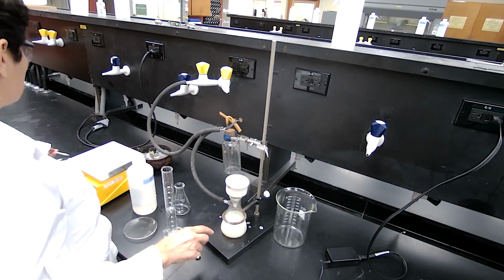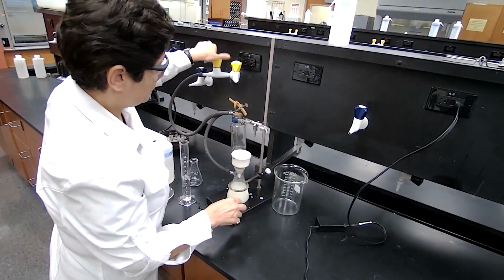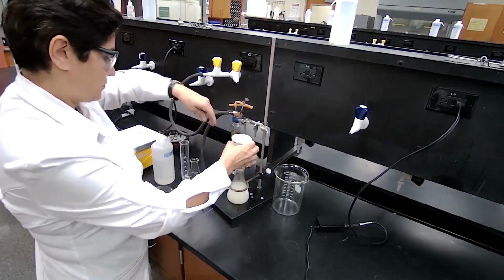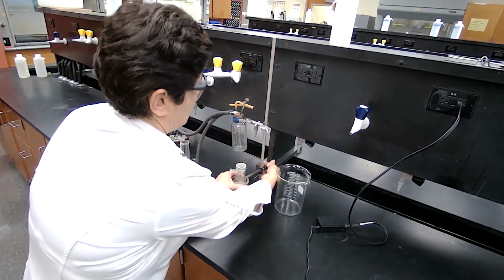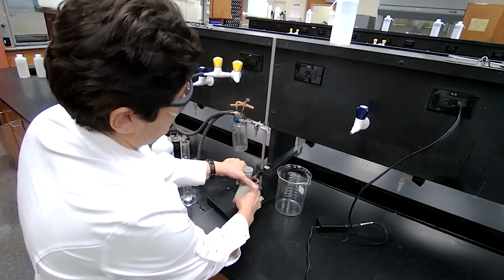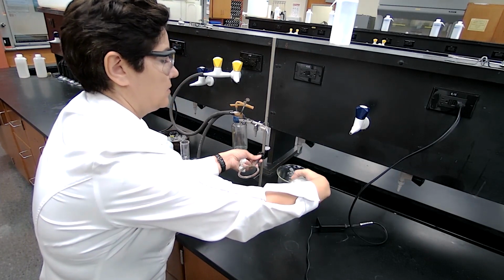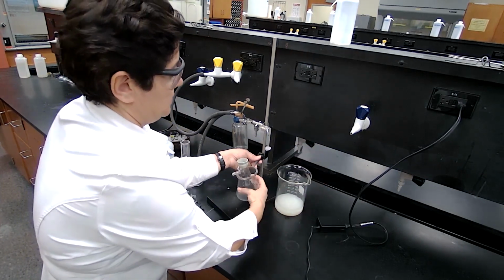So at this point, I'm going to stop the vacuum, detach the flask, pour the liquid into a waste container, and reattach.